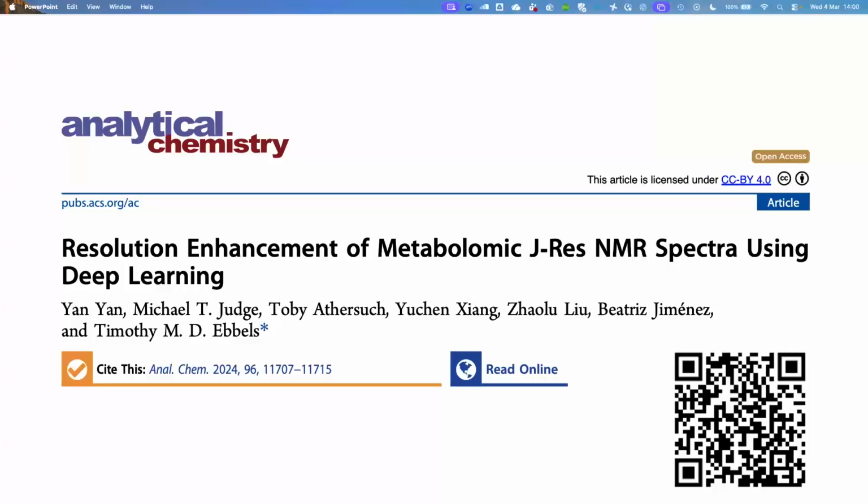Even within one sample spectrum, you'll have small variations in peak shapes and peak widths. And certainly from sample to sample, if you run 1,000 samples across several weeks on an NMR spectrometer, even though it is a really stable instrument, you can still get small variations. So there are limitations in what you can assume in terms of peak shape.